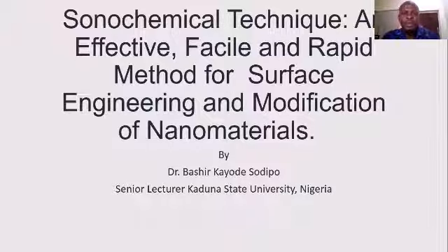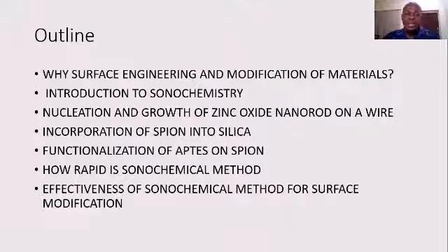Physics. Today, I will be presenting the sonochemical technique. This is a technique that, throughout my PhD at the University of Science Malaysia, we developed towards using it to engineer or modify the surface of nanomaterial. The outline of my presentation goes thus.